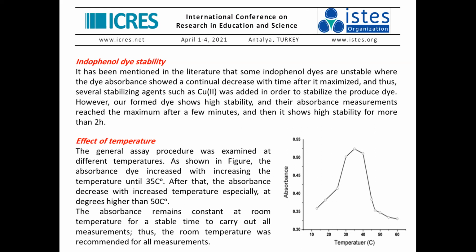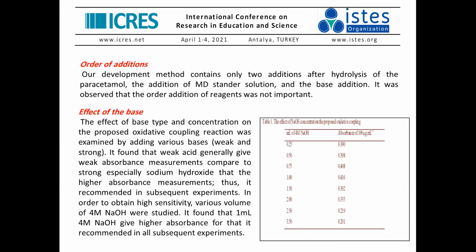Also, we studied the order of addition, because we only have two compounds: adding the hydrolyzed paracetamol with methyldopa in the presence of a base gives a color directly. Therefore, there isn't much of an order of reaction. We just switched the compounds and didn't find any effect of the order of addition. Therefore, we moved directly to study the effect of the base.